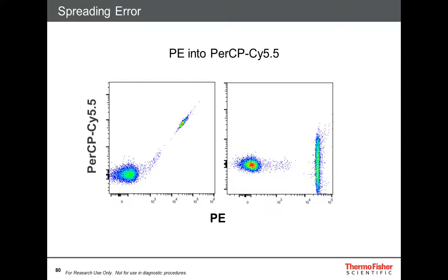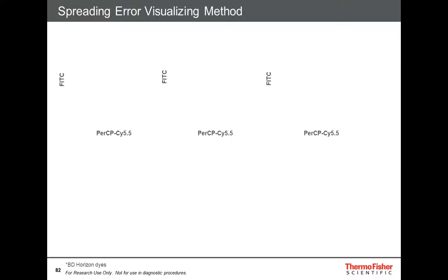When we compensate that data, you can see the spread of this data. So compensation lets us visualize the spillover and the spread. If we used a gate on the unstained population, obviously it looks like there's a population of double-stained cells on the right. Those aren't double-stained. We would have to use an FMO. But these cells are definitely there.